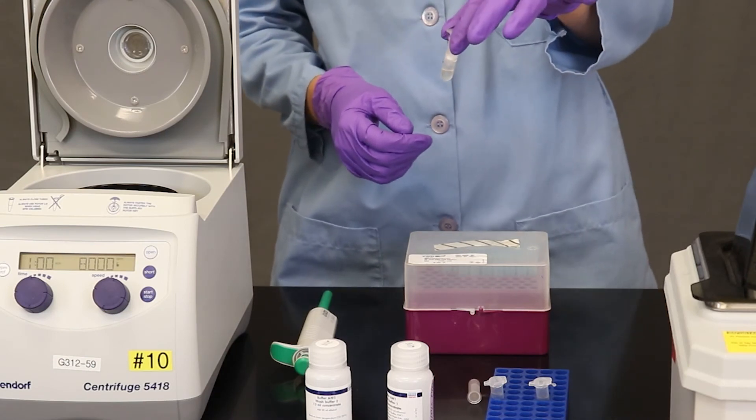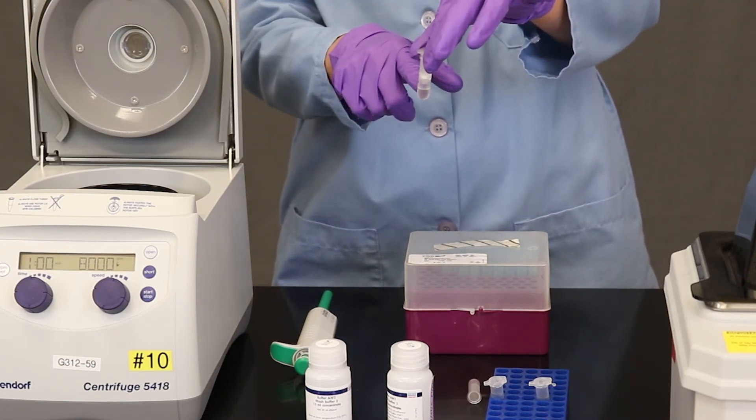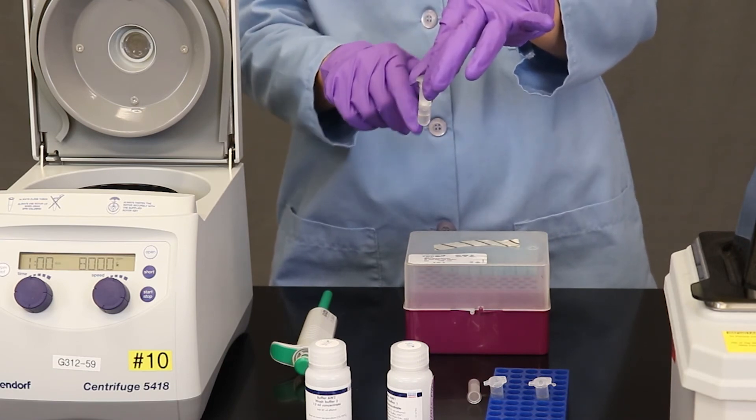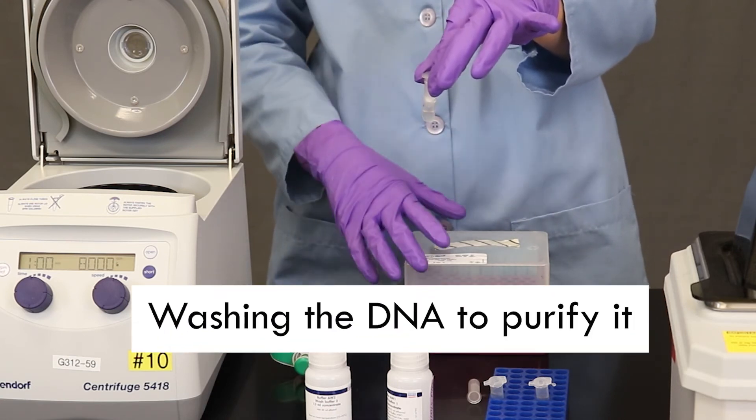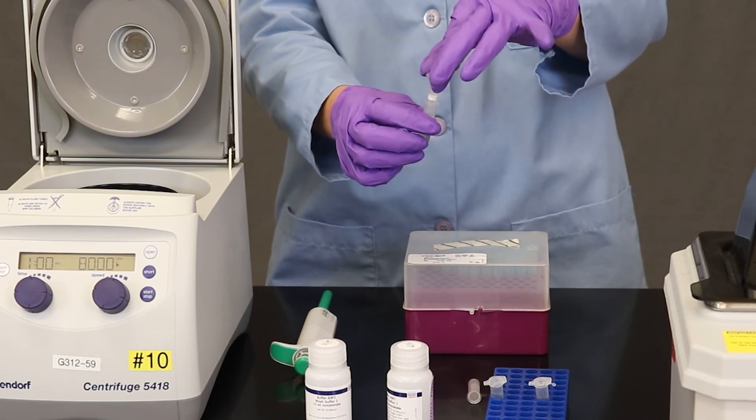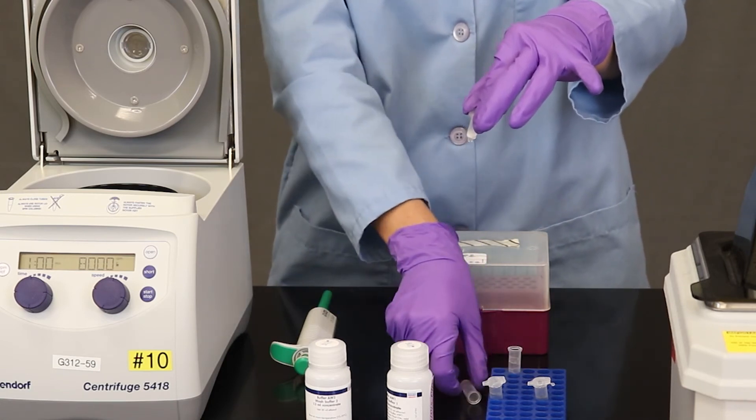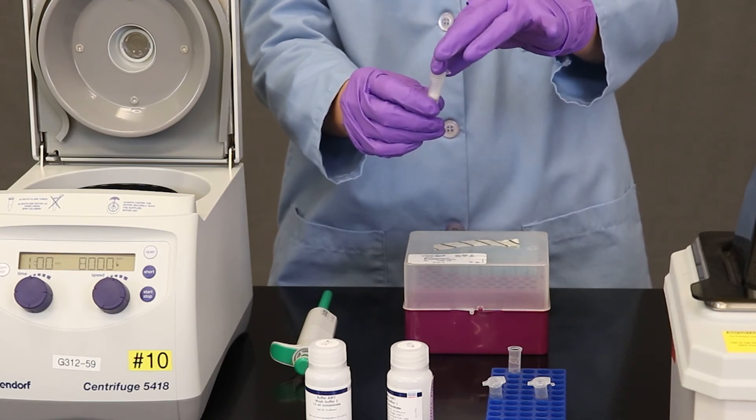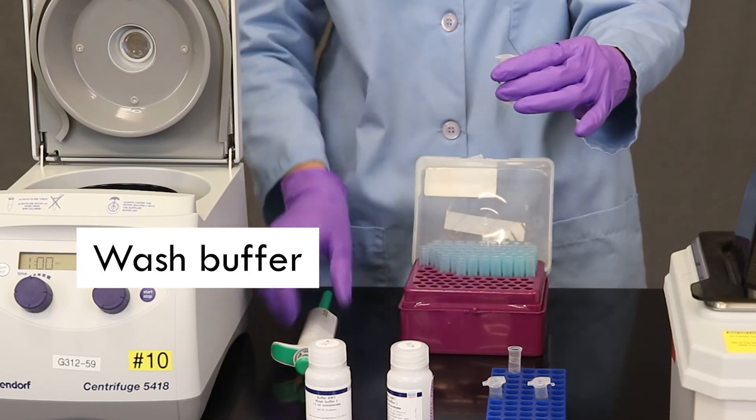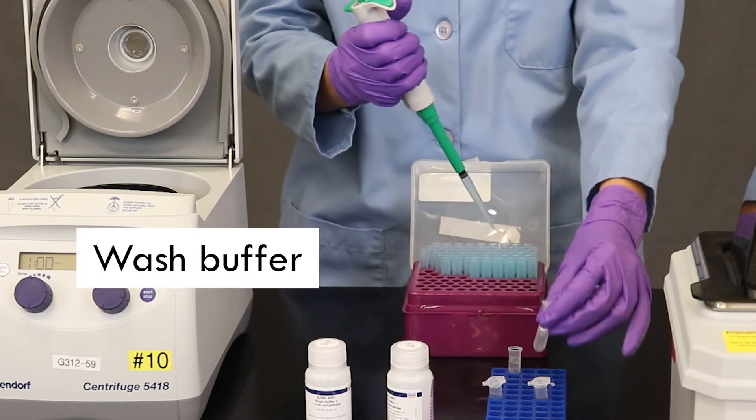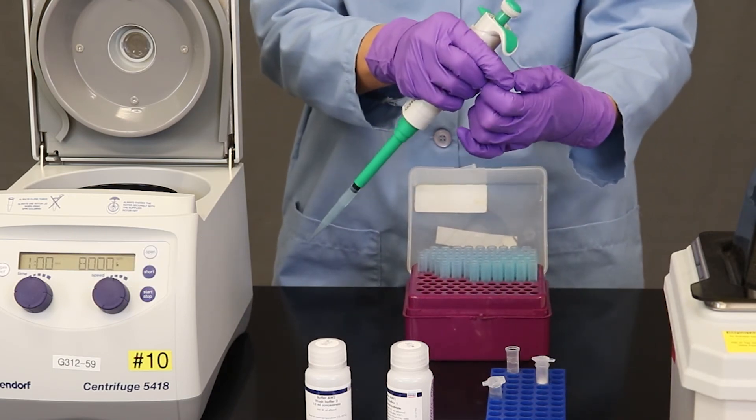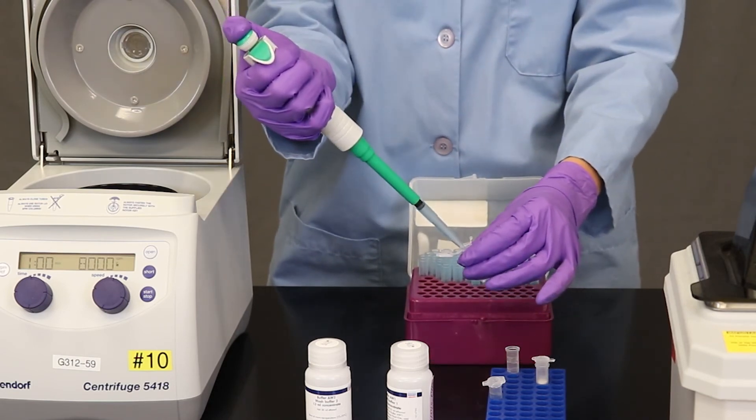If you look in this mini column, what you can see is there's some solution at the bottom that's passed through the filter. And the DNA is now in the filter. So the next steps involve washing the DNA to purify it in the filter. So the first thing I'm going to do is I'm going to remove the bottom of this mini column. And I'm going to put a new bottom part on. And now I'm going to add 500 microliters of wash buffer. And this is just to remove impurities from the DNA.